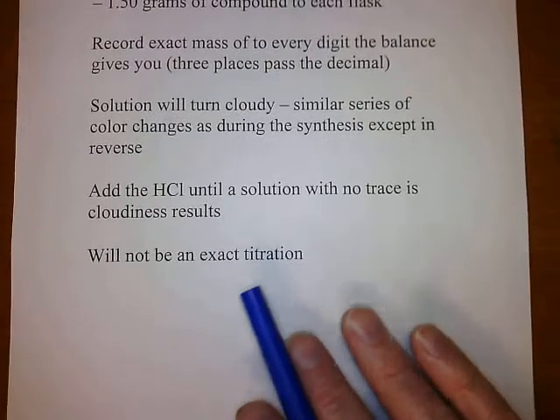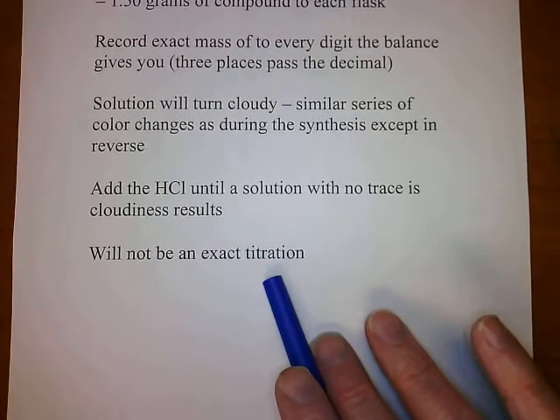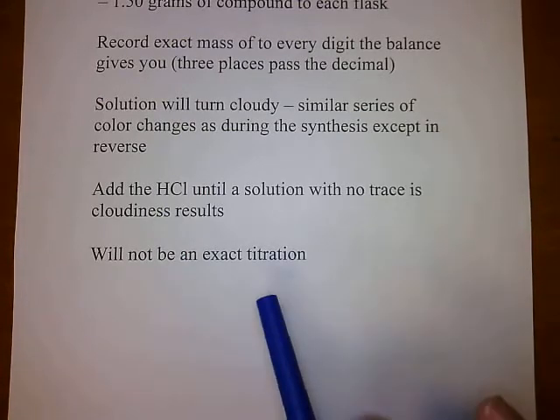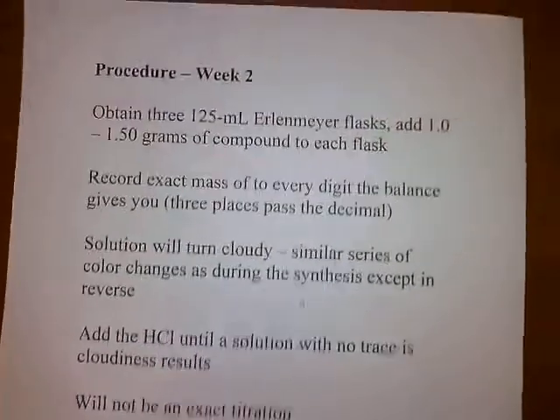Now, this is not going to be an exact titration. It's not going to be like an acid-base titration with phenolphthalein where one drop is going to make the difference between 2 extreme color changes. So you'll have to use some judgment as to when exactly to stop the titration.